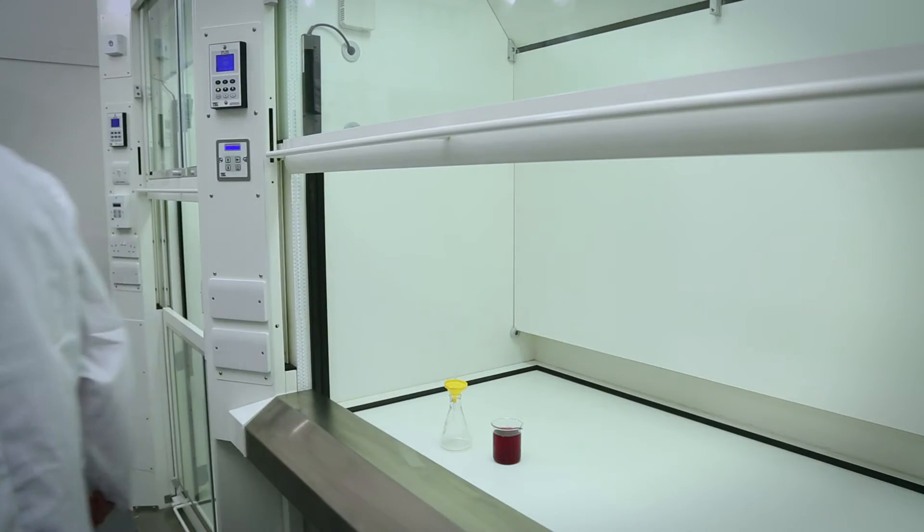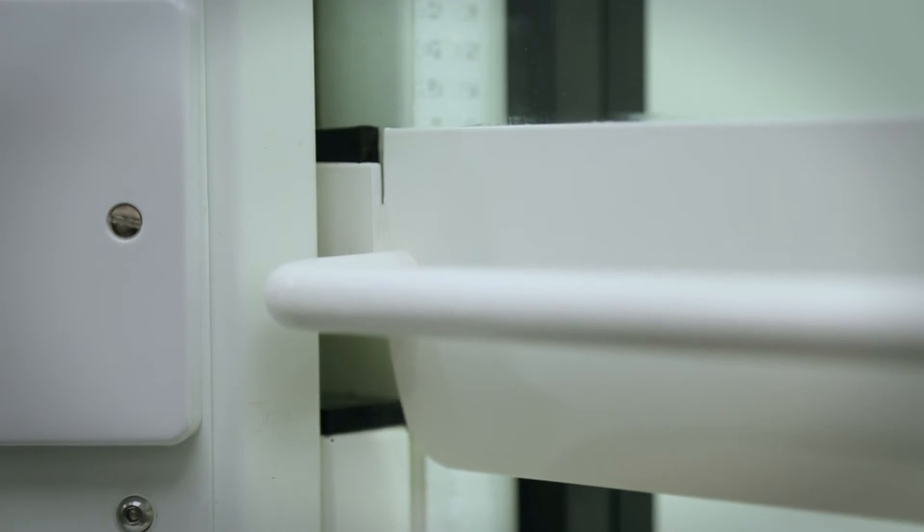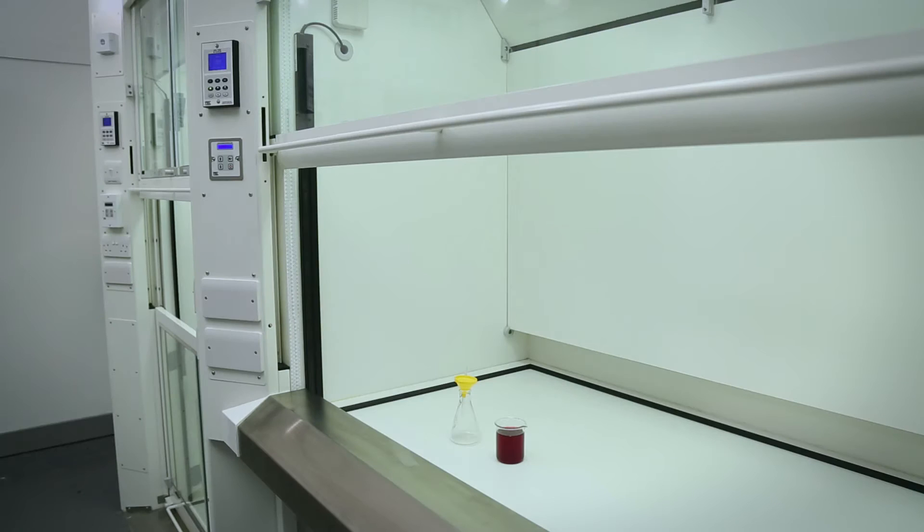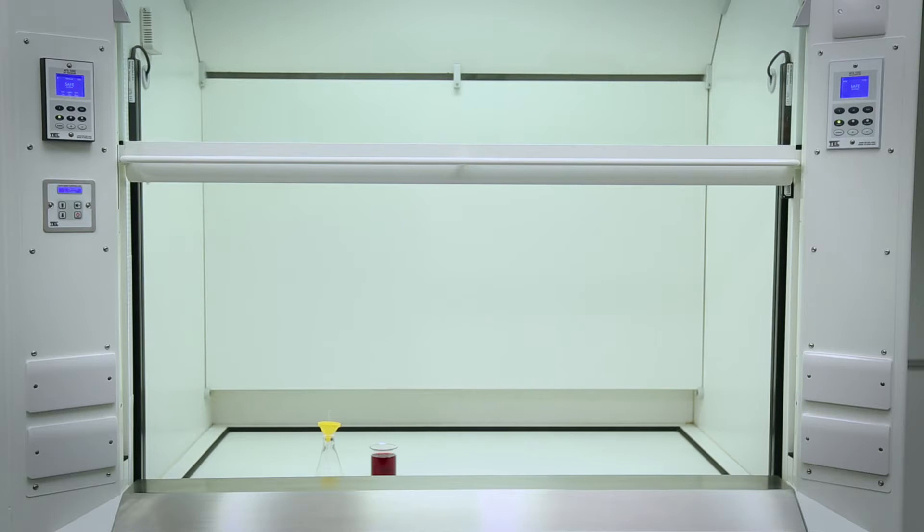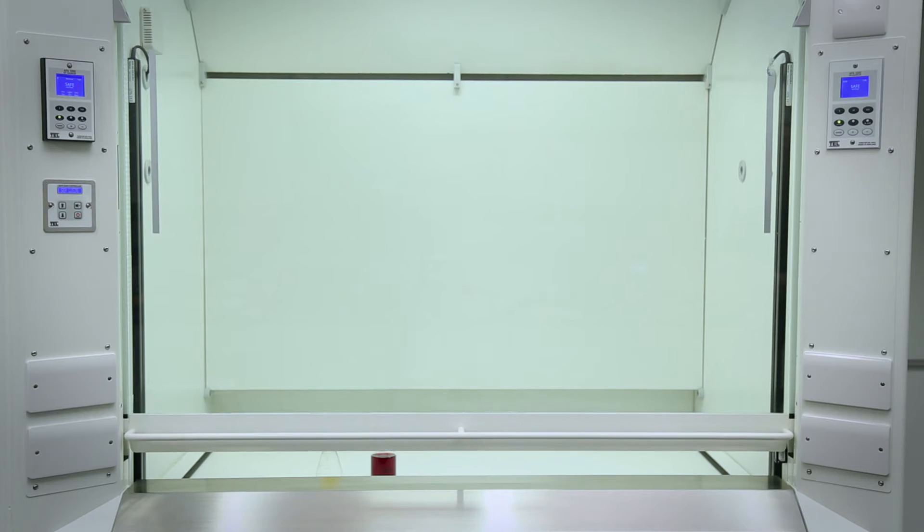We've specifically designed our auto sash controller to close the sash automatically when the operator is not present in front of the fume cupboard. If no movement is detected and the sash opening is clear, the sash will automatically close after a predetermined fully adjustable time.